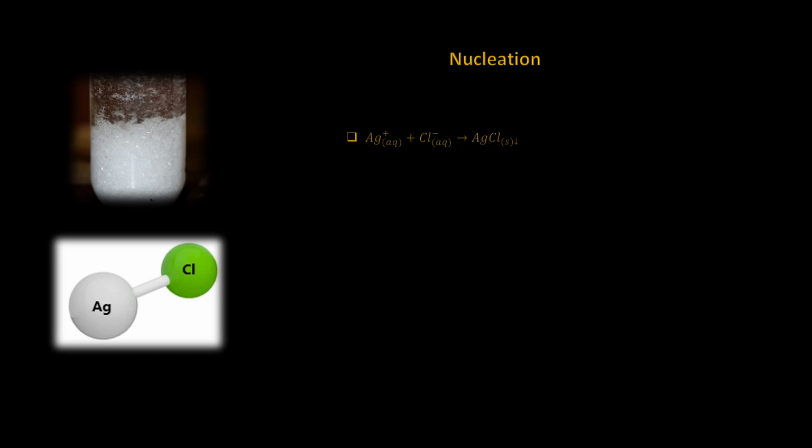The addition of chlorine from the addition of potassium chloride will dissociate into separate ions. The solubility rules show that potassium is fully soluble in water. An excess of potassium chloride dissociated gives an excess of the chlorine ions. The chlorine ion will combine with a silver ion, forming a single molecule of silver chloride. Although microscopic, it becomes a solid floating around in the solution. That molecule is referred to as the seed molecule, better known as the nuclei of a crystal.